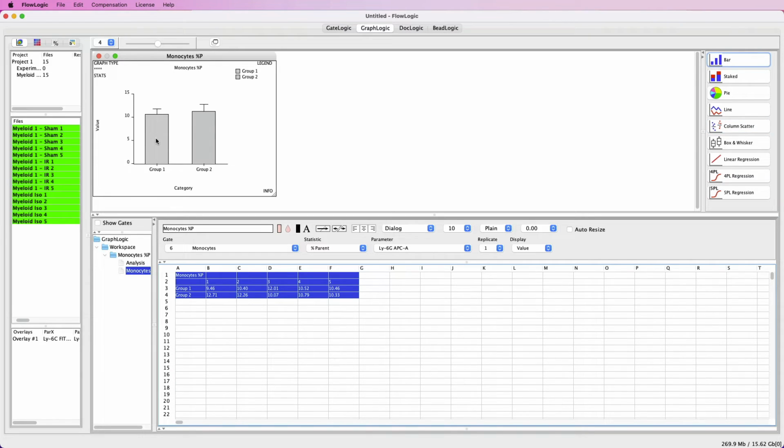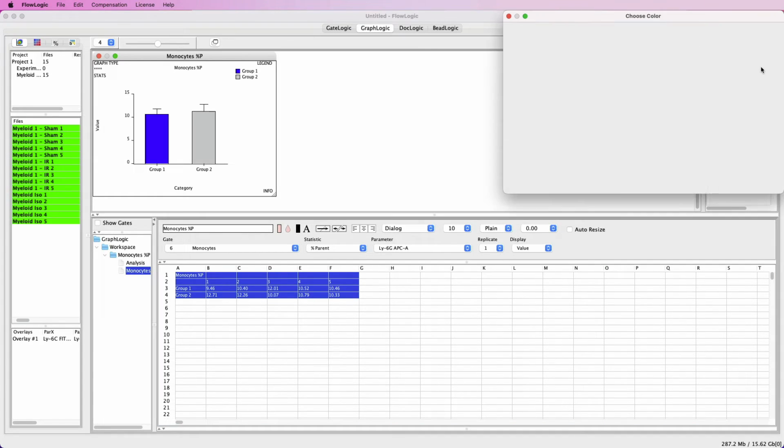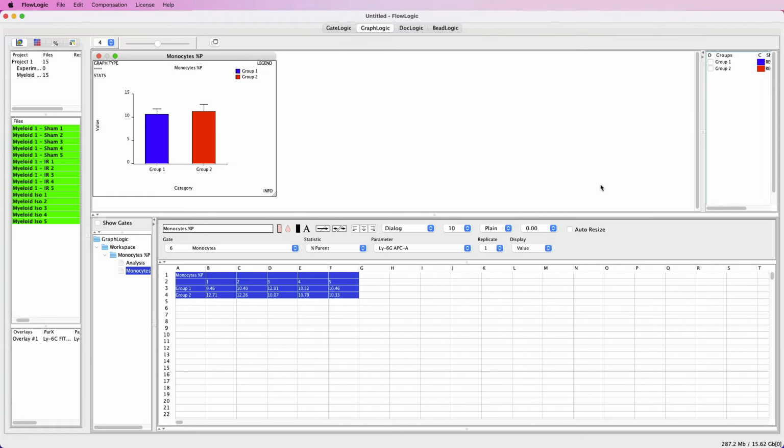You could also click within a portion of the graph, such as within a bar in this case, and choose to recolor the bars. Click and drag to reposition the legend or format any of its attributes using the formatting panel options. You can click on graph labels if you wish to change the direction that they were displayed in, and even click on any of the titles or labels to change the font type, style, size, or color.